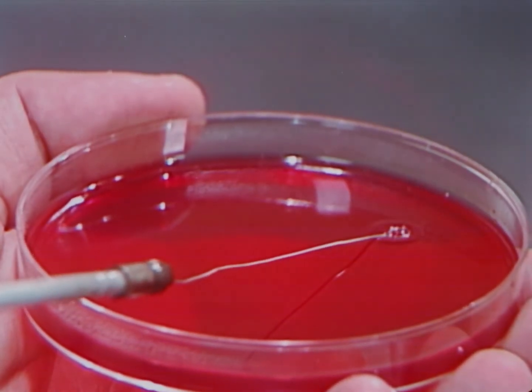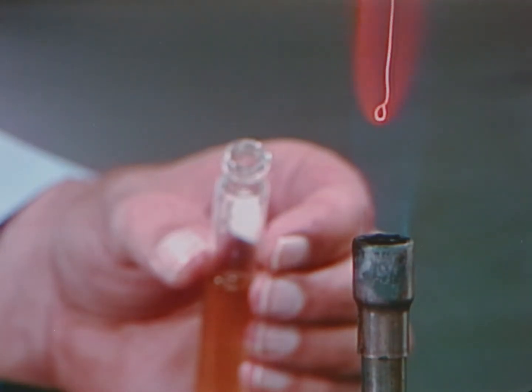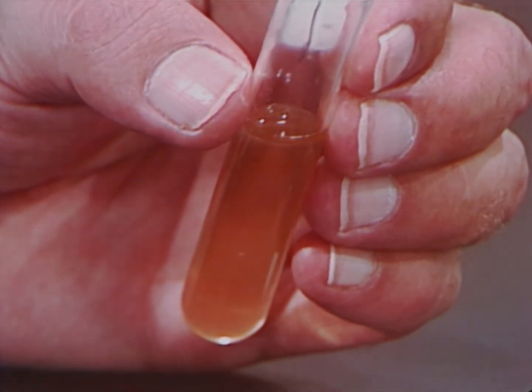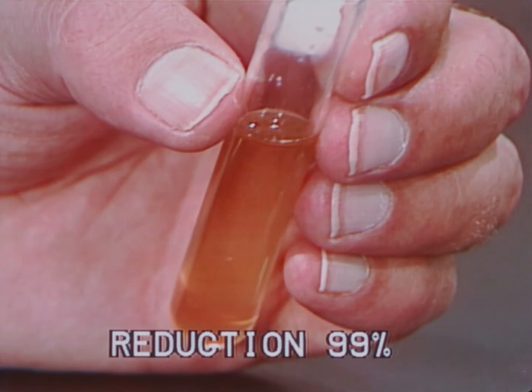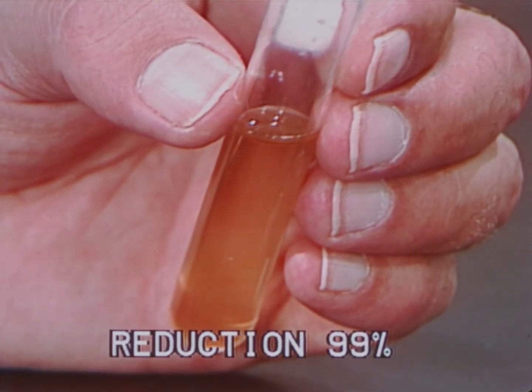When the hot loop is immediately touched to colonies on solid media, or when the hot loop is inserted into a liquid microbial culture, the sizzling creates a dangerous aerosol. Aerosol formation may be reduced as much as 99% by allowing the loop to cool before using it.